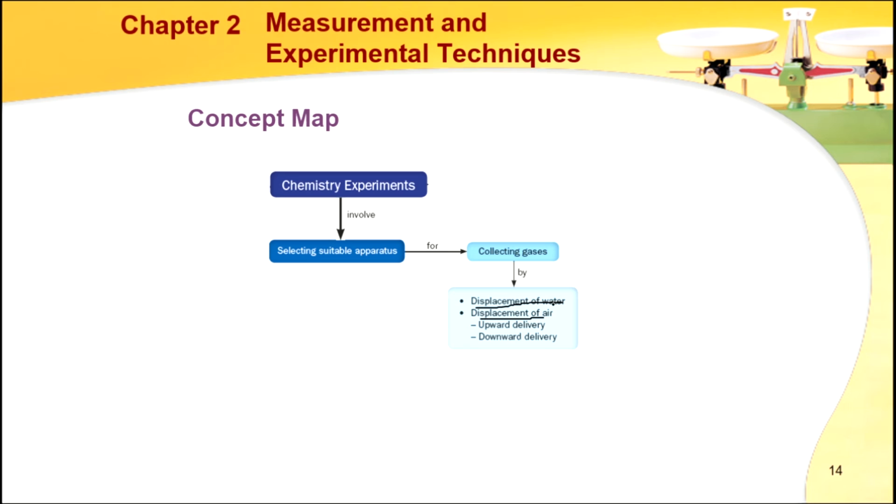We can use displacement of water if the gas particles are insoluble or slightly soluble.